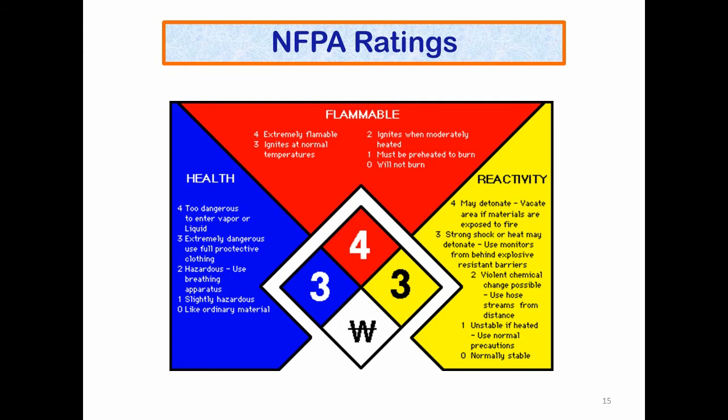NFPA ratings are in three categories: health, flammability, and reactivity. Low numbers are not hazardous, and higher numbers are hazardous. So 0 to 4 is the range. Please be aware that if you're working with a higher rating material, you must take more and appropriate actions.